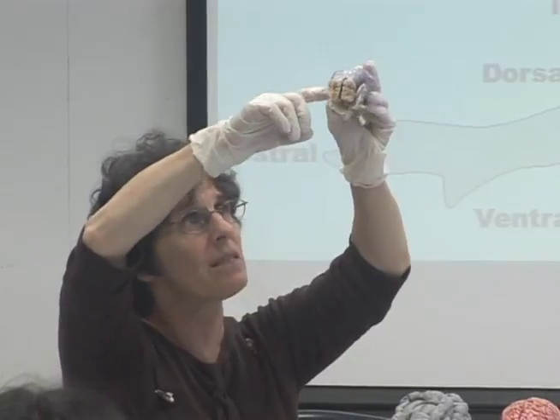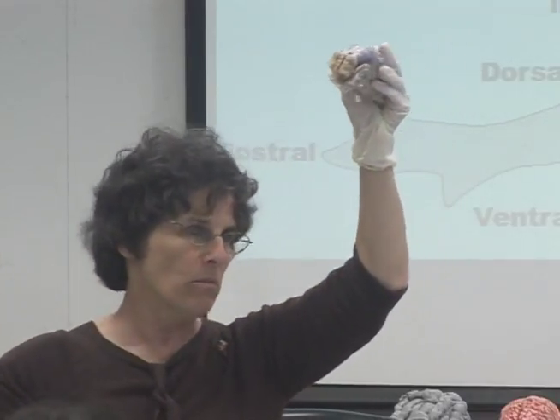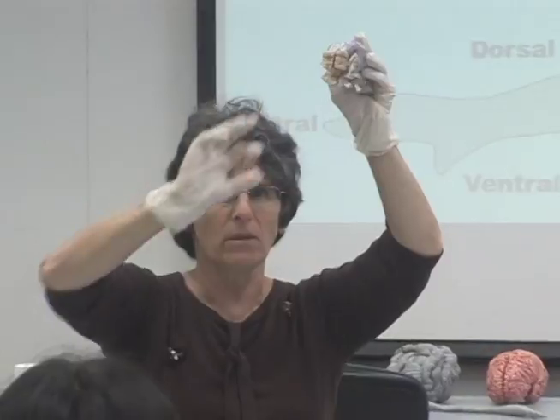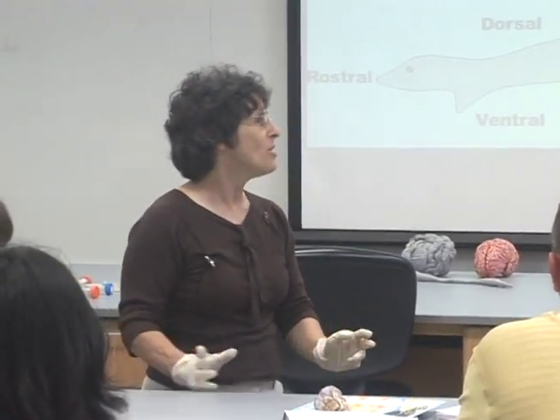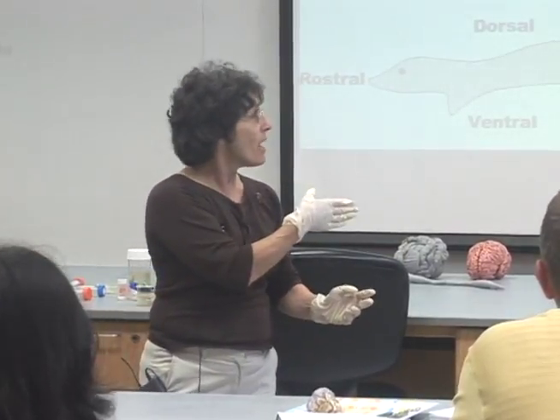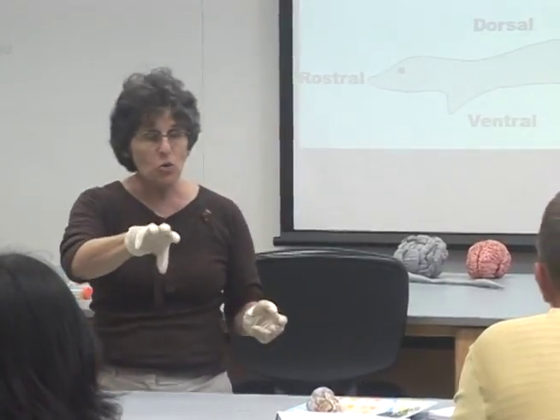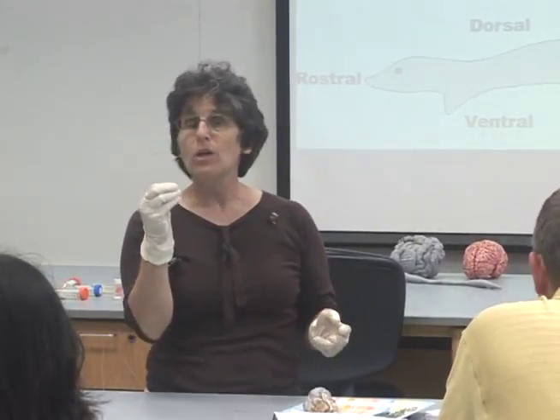You can trace not only the optic nerve going into this bundle, but you can also trace other nerves. What other nerves might you anticipate would need to go to these eye muscles? Motor neurons that control the muscles of the eye and the eyelids — exactly. Your eyes go from left to right and up and down, and moving those eyes requires muscles. There are six muscles around each eye, and those eye muscles are controlled by axons of nerves that come straight out of the base of the brain. We're going to look for those nerves.